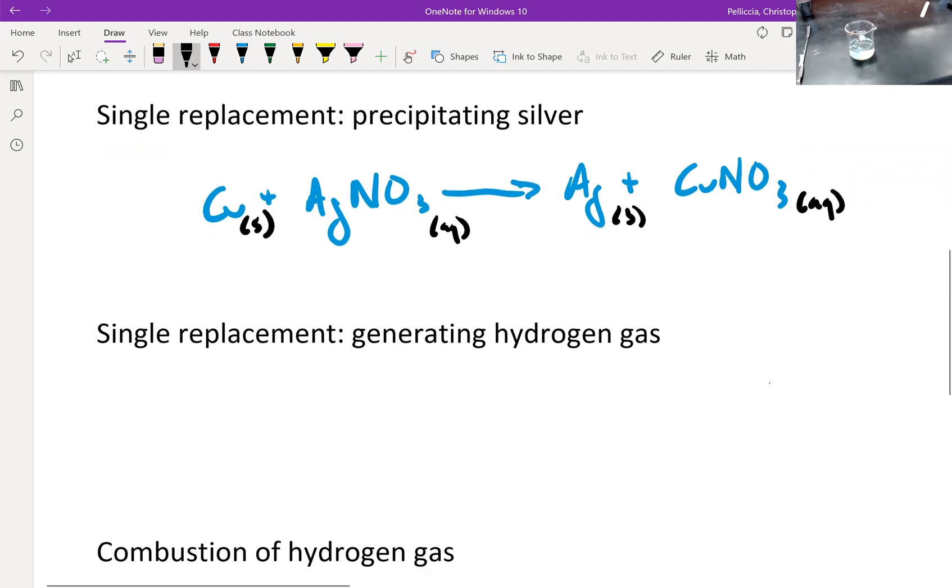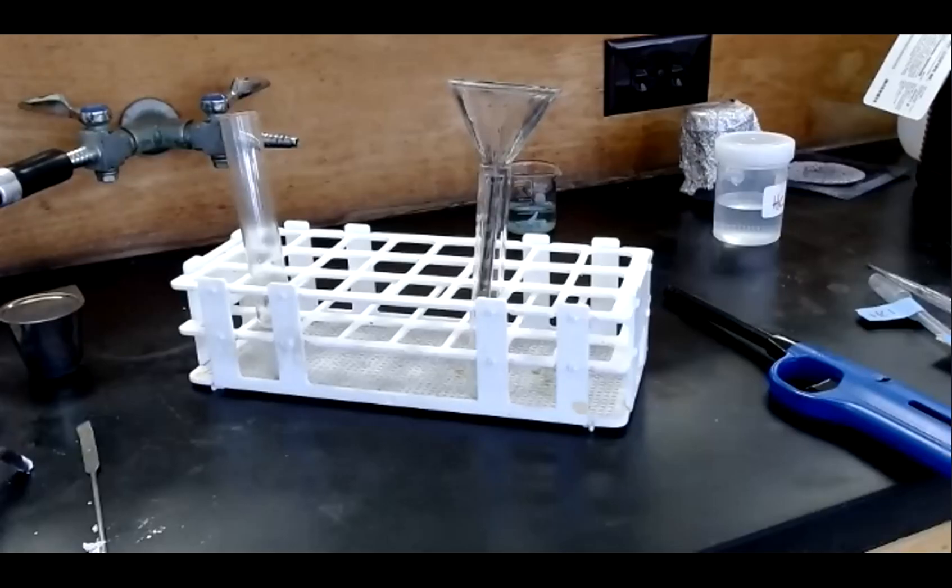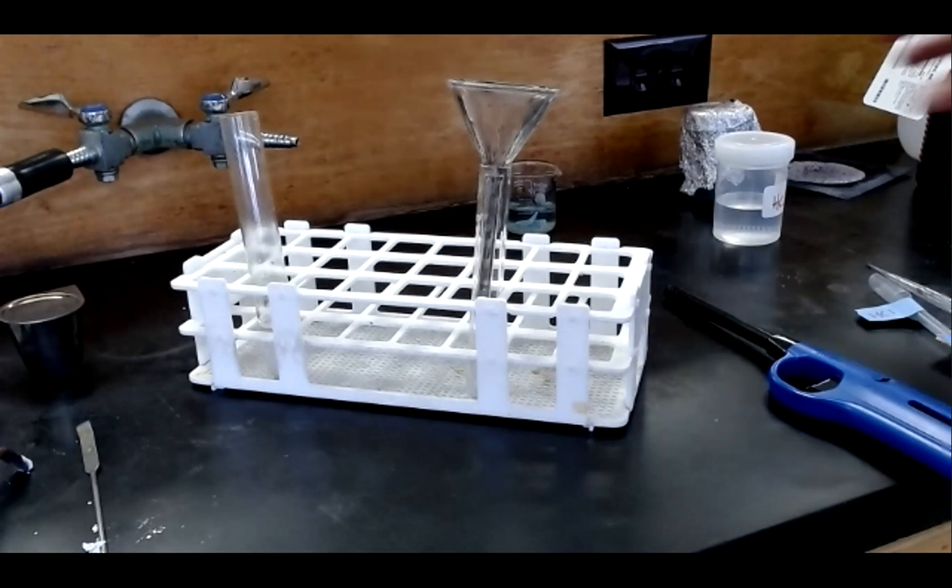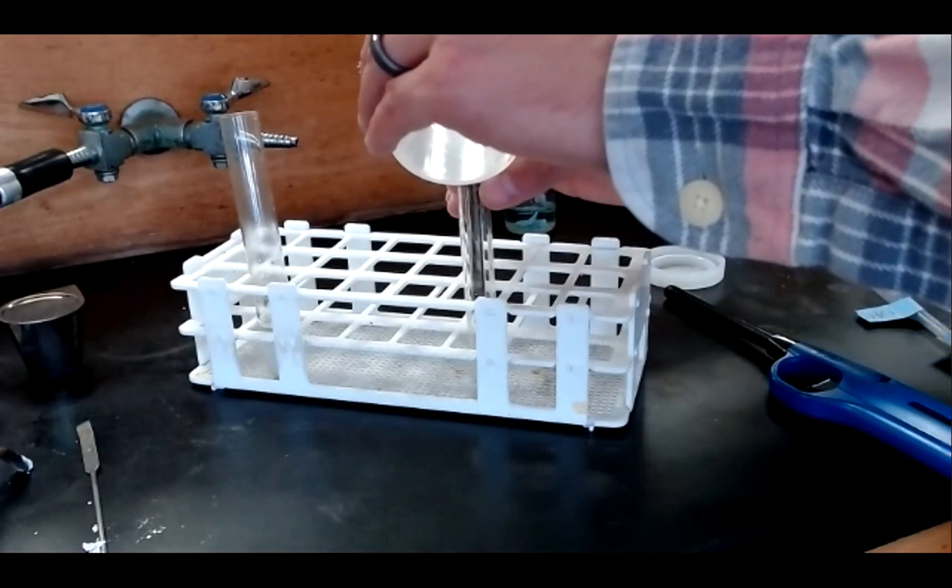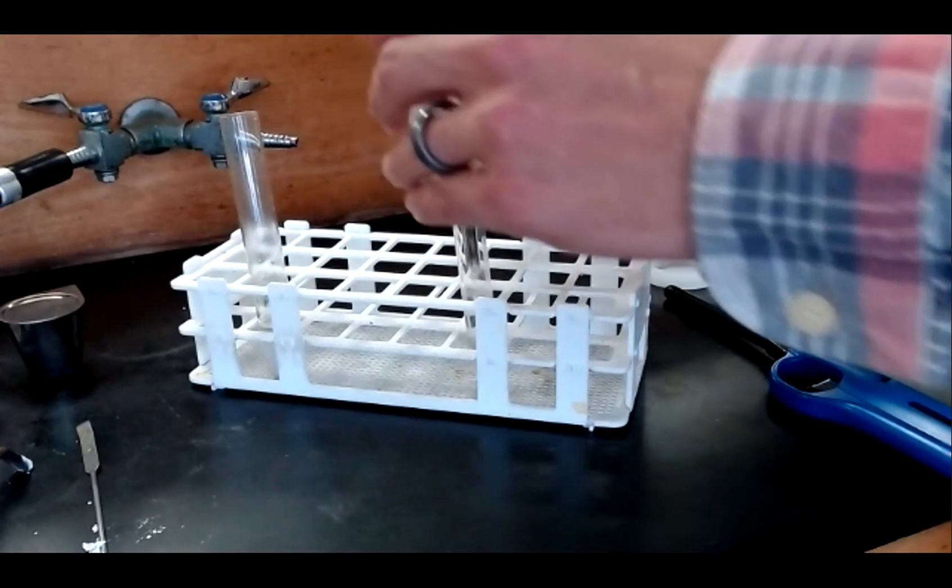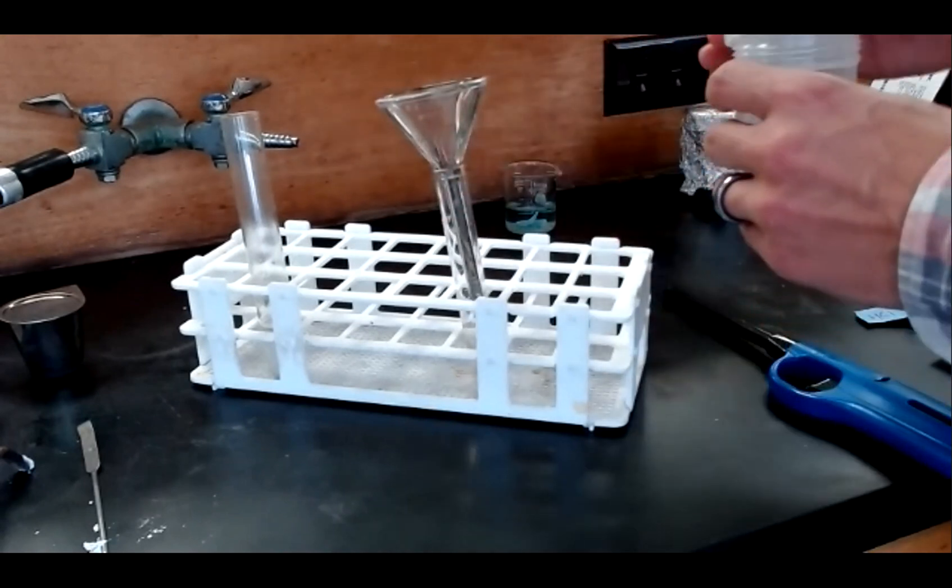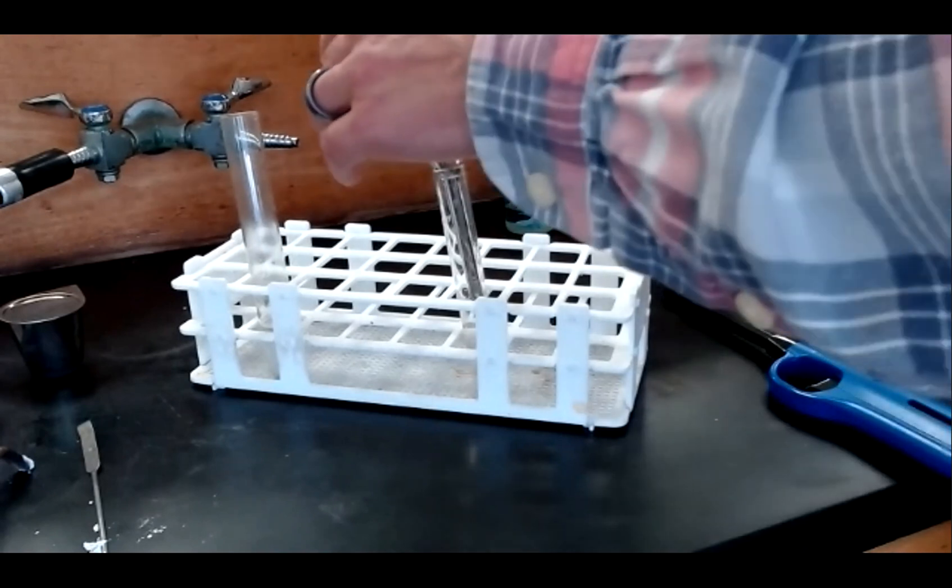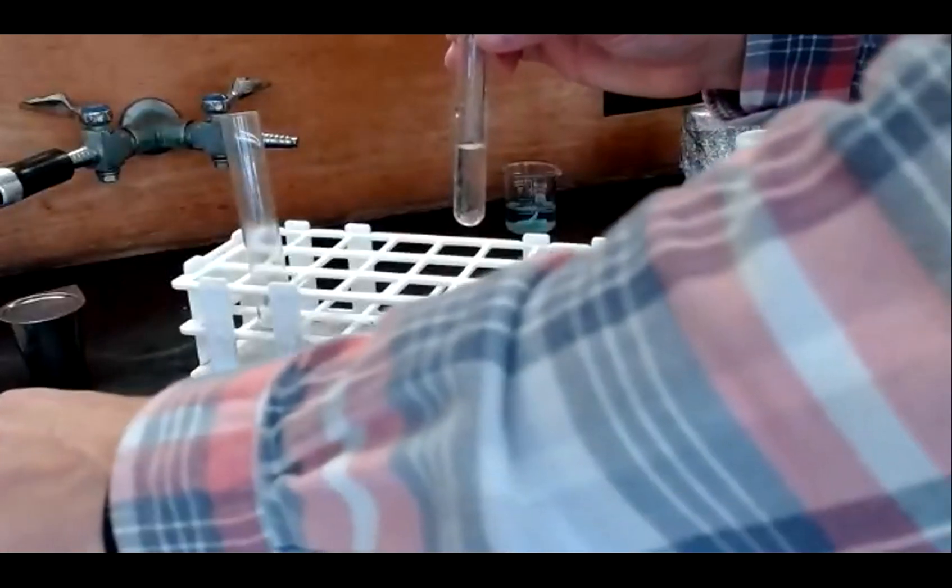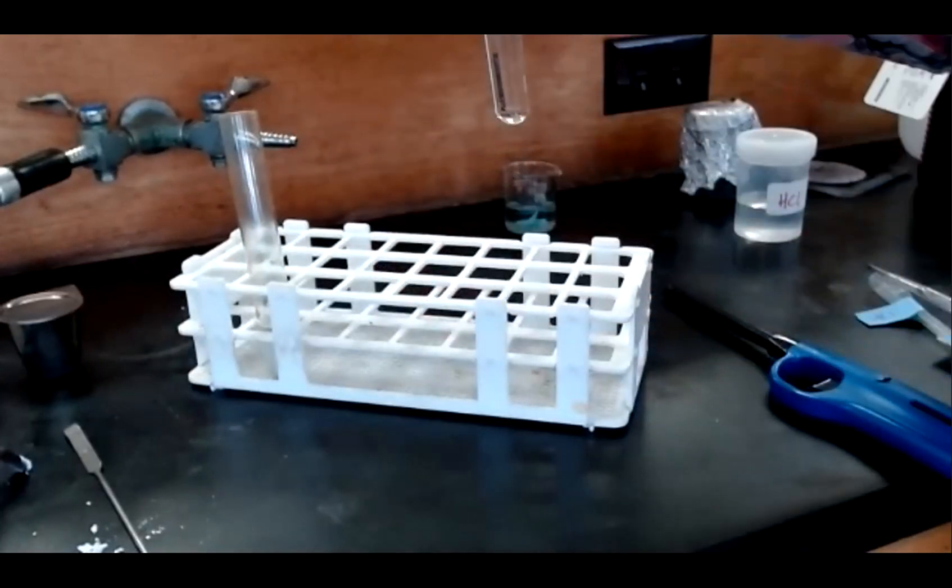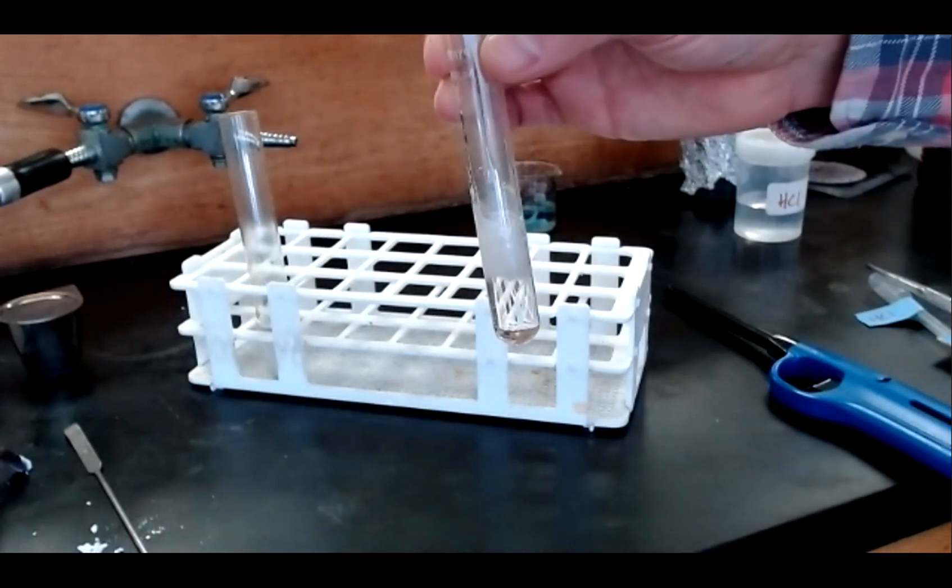A second single replacement reaction I'd like to show you is the generation of hydrogen gas. To generate hydrogen gas, I'm going to add hydrochloric acid to magnesium metal. So first I'll start by adding a small sample of hydrochloric acid to this test tube. Then I'm going to add a sample of solid magnesium metal. Here's my piece of solid magnesium. Put it in the test tube. Immediately you can see a vigorous reaction begin.